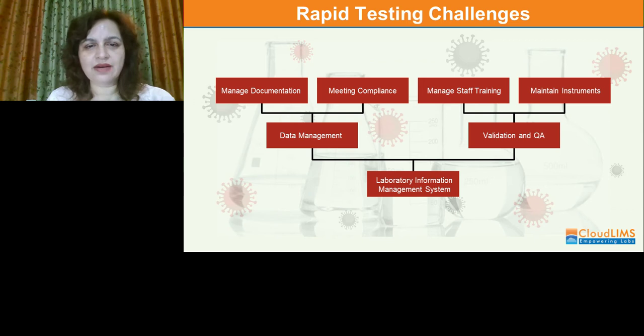A lab needs to standardize and validate new test methods as they evolve, even before testing COVID-19 specimens. Having the test methods in place is vital to the functioning of the lab. Getting supplies such as reagents, equipment, and personal protective equipment has been a challenge, with these available in short supply due to these unprecedented times. Meeting compliance is another challenge, particularly that of HIPAA, CLIA, and ISO 15189. Therefore, the US has mandated that the tests be conducted in CLIA-certified labs.